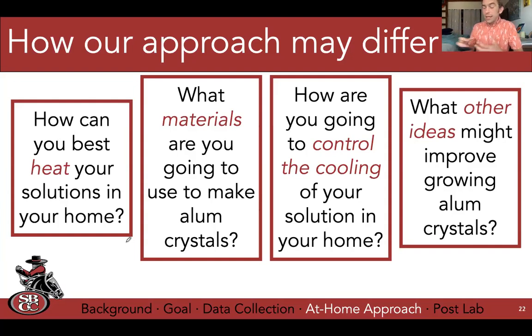So just taking the container, getting your important thing out, patting it dry, and then you put the container in the microwave, heat it up, stir it, heat it up, stir it, and keep working until you have that solution. And then you can add a little bit more alum, make sure it's right on the edge of the solubility point, put your thing back in and put it back wherever it's living in its nest.